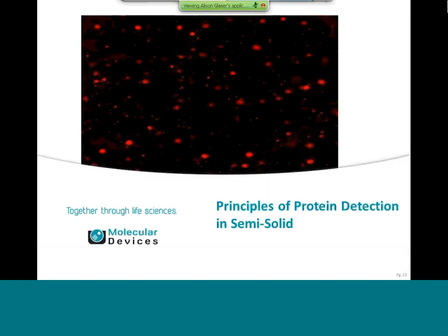Now that the fundamental instrument process has been discussed, what is the basis of plating in semi-solid? How are these target proteins detected? For the next few minutes, I will discuss how this is achieved, and then I will discuss how GPCR target proteins are detected.